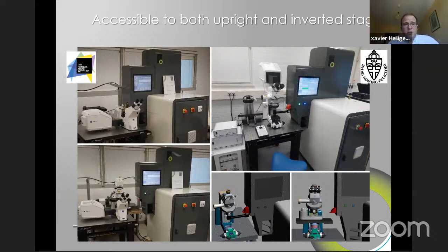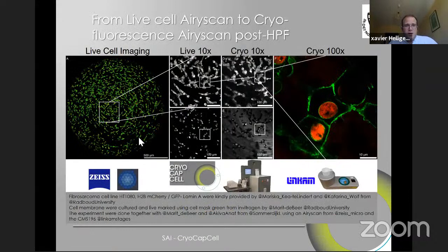And so once you have this setup here, you can do live cell imaging, and here you have an overview of the entire carrier containing many live cells. And when you zoom in, this is done at live cell imaging, you have a 10x image where you can find your cell of interest, focus on whatever you want, and then do cryo microscopy, still using the 10x, and then zoom into the 100x. And here in that case, what you can see is that these cells are exactly the ones present in here. So you can see that we've been able to go from live cell imaging to cryo-light microscopy without losing focus of our sample.